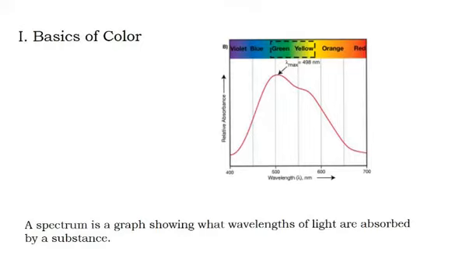We could also do this on a spectrometer like the Shimadzu, which is the one we're going to use today in this lab, and in that case the spectrometer does it for us. So it'll scan the wavelengths for us and go through all of the wavelengths and take the absorbance readings and then create a plot for us.